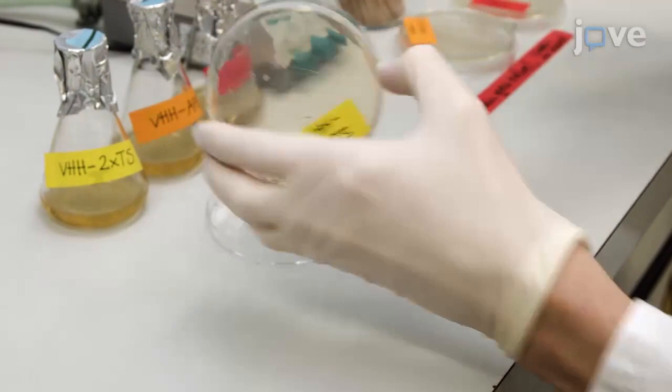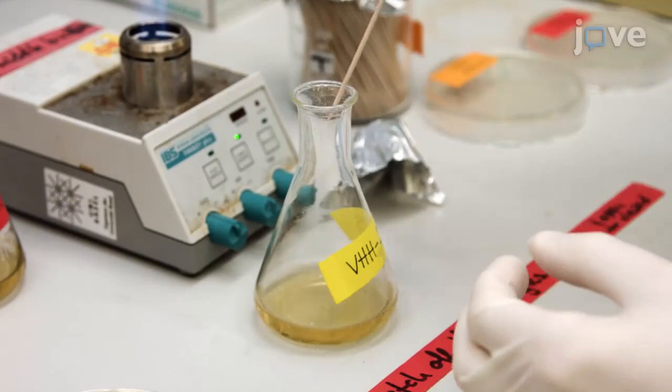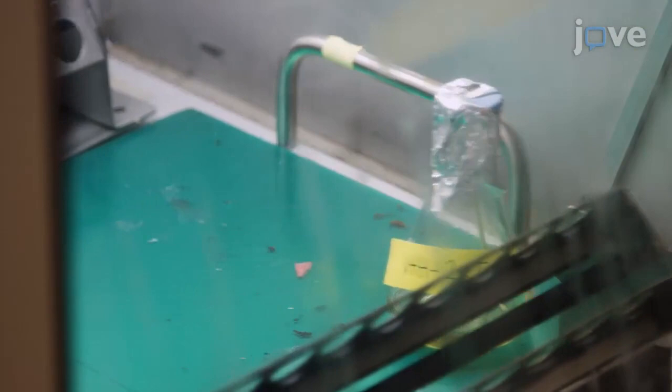To begin this procedure, pick a bacterial colony containing the vector of interest from the plate, and inoculate a flask containing 20 milliliters of LB medium supplemented with antibiotics. Incubate overnight at 37 degrees Celsius in a shaking incubator.